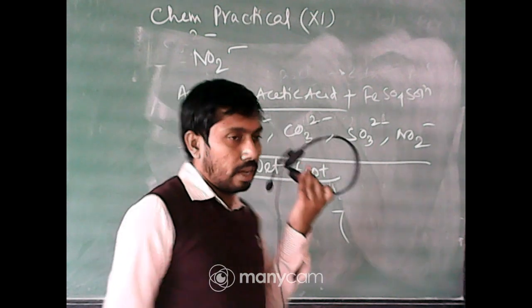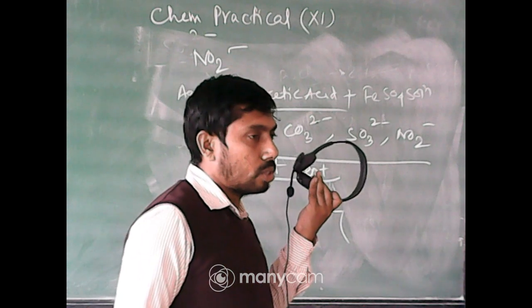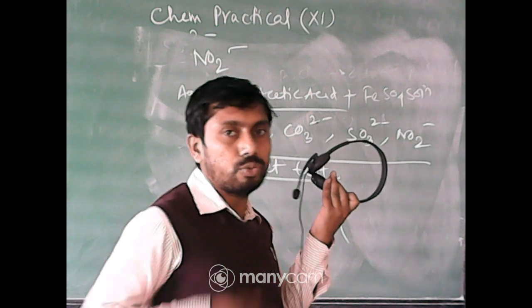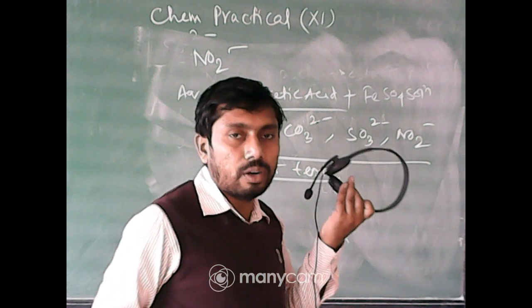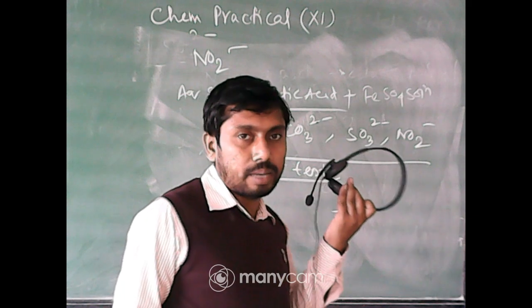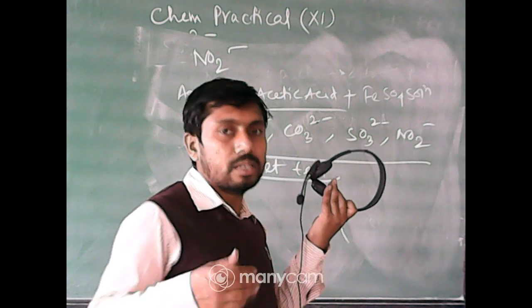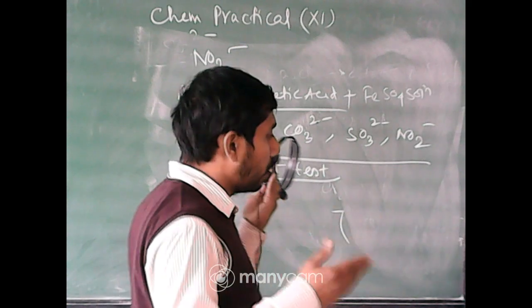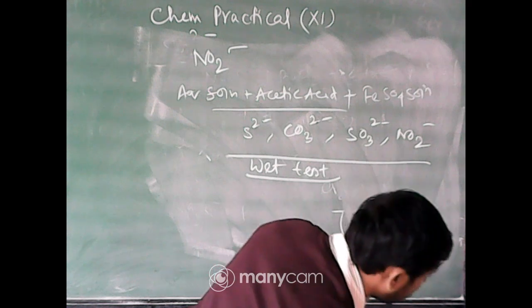Qualitative analysis has a lot of experiments, so we have to do it step by step. Next day we will do some more tests for anions, the remaining anions. Next, for cations. In that way we have to go through the step by step method. So thank you everyone.